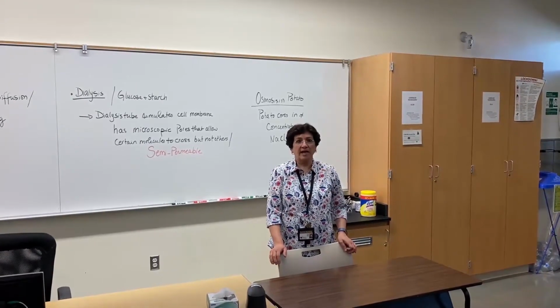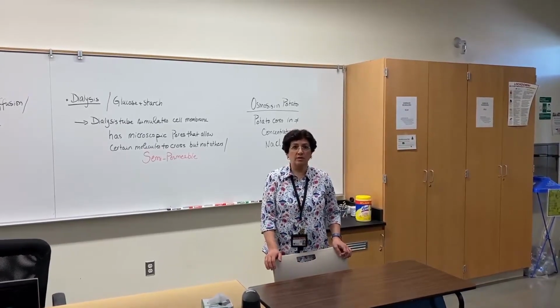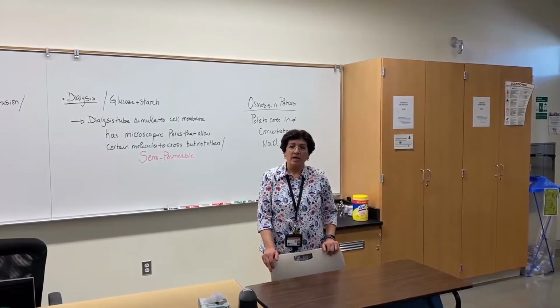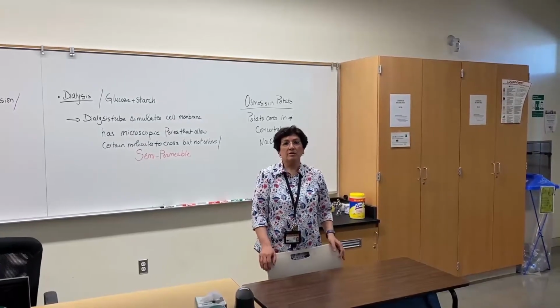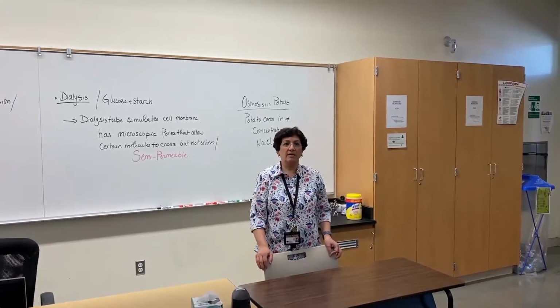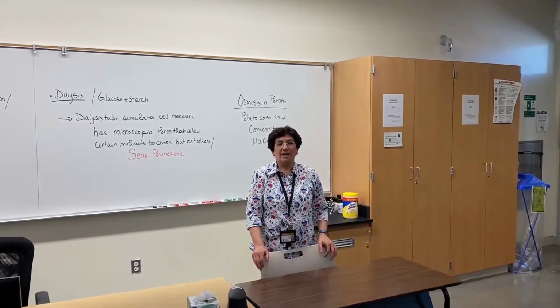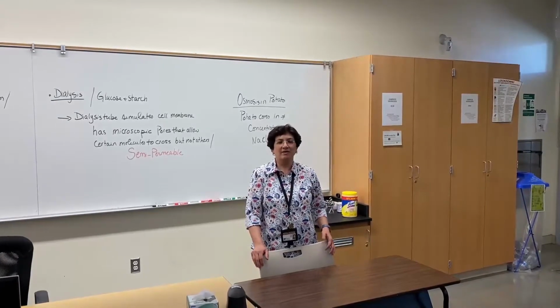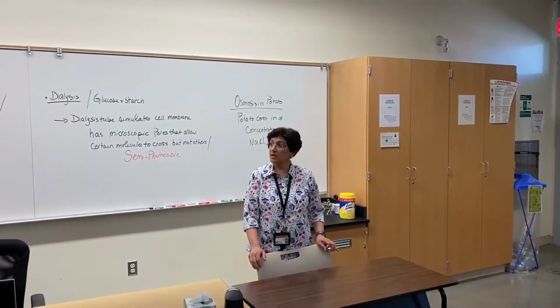Unfortunately, we didn't have access to Elodea, the plant that we use, so we could not do this demonstration for you. We're going to start again in your lab introduction. Your instructor should have discussed with you the cell membrane, the properties of the cell membrane, namely mainly talking about the semi-permeability of the cell membrane and its structure.